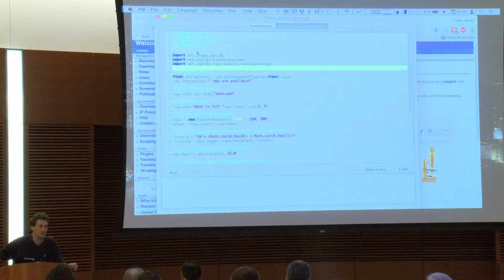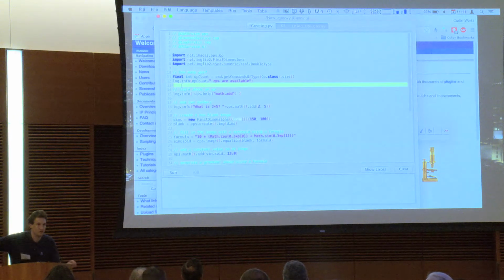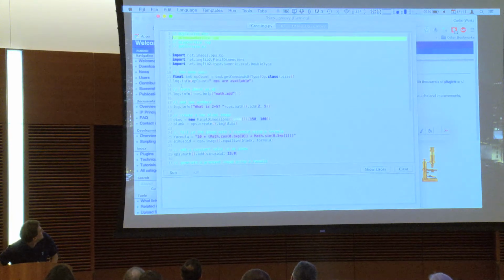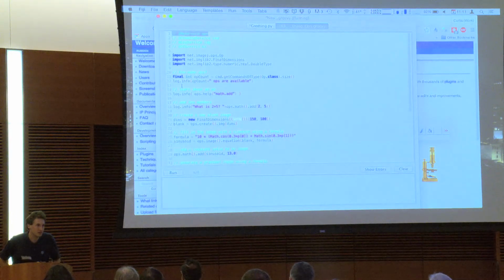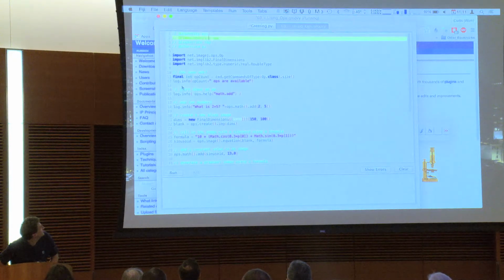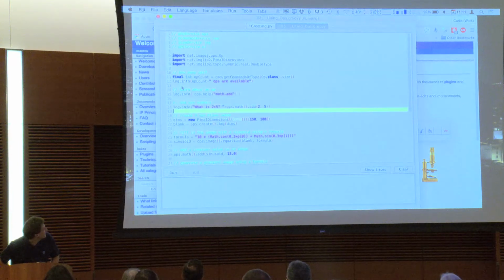For example, if you saw Brian's talk about Richardson-Lucy deconvolution and you want to do that by calling into ops, this workshop will show some of that. Here, this is a lot like my intro to ImageJ example. It's boring stuff, but it's basic stuff, showing you some of the fundamentals of ops. Ops is all driven by this thing called ops service. All you have to do to tap into ops is to add this ops service as an input called ops. You don't have to call it ops. You can call it fun times if you really want to, whatever. I just like ops.